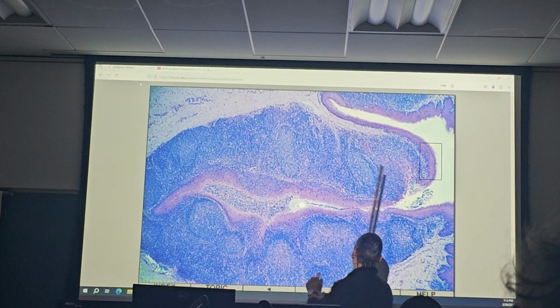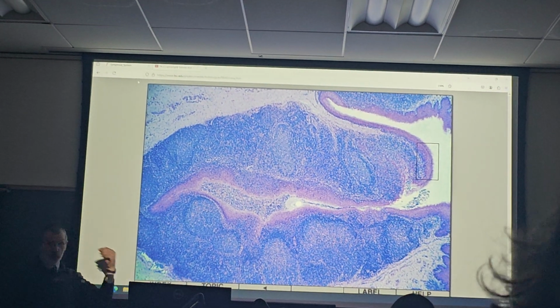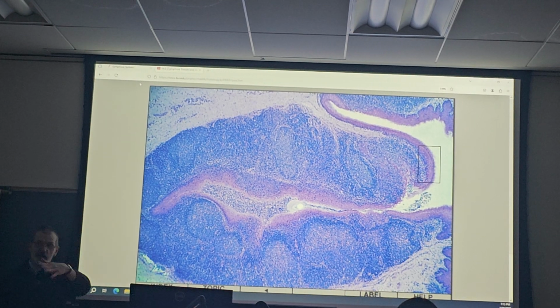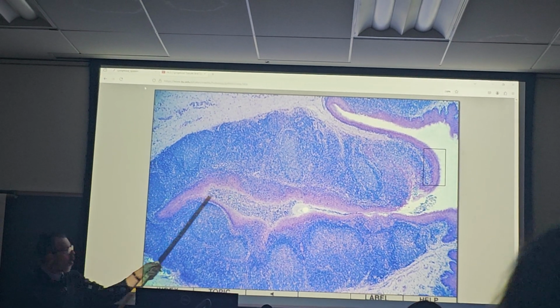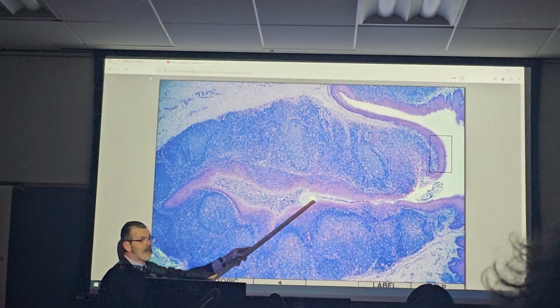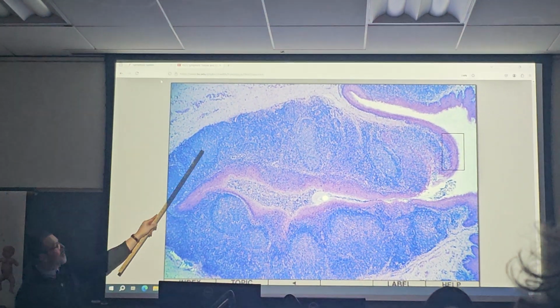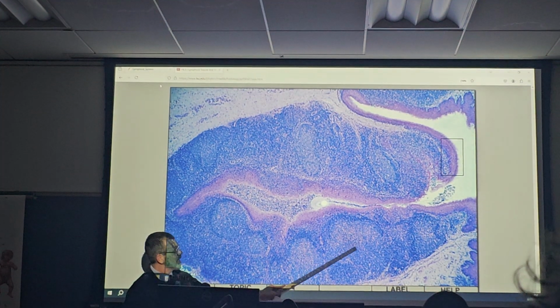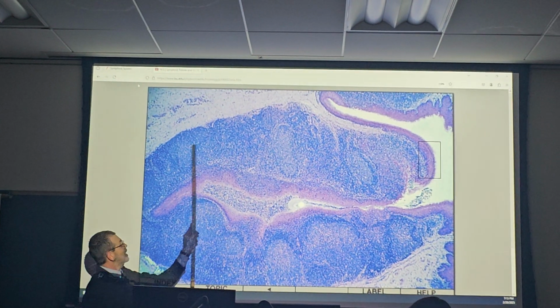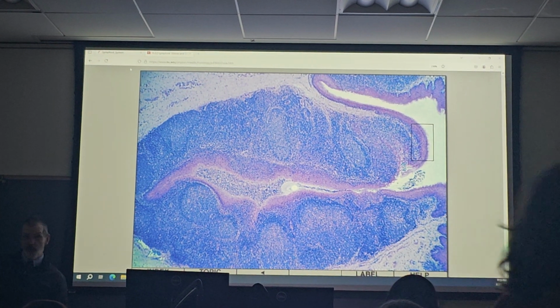So that area is called the crypt. A tonsillar crypt, because where do you put dead people? Under things, in a hole. That's a hole to put things. Don't ask me, they name it when you're drunk. But that's called the tonsillar crypt, the mouth and stomach of the caterpillar. Then what are these big circles going to be called that you see here? The spots on the caterpillar are called the nodules, because that's the same rings as before.